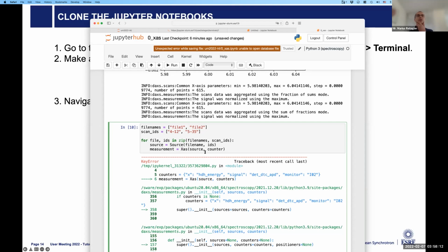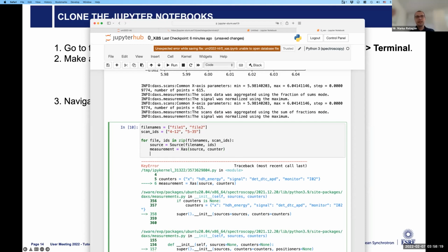Okay, so after you do this analysis, you can just say plot all of the resulting, so whatever, so PLT, it's actually an axis plot.